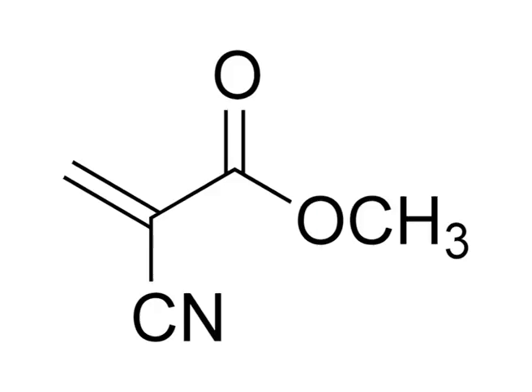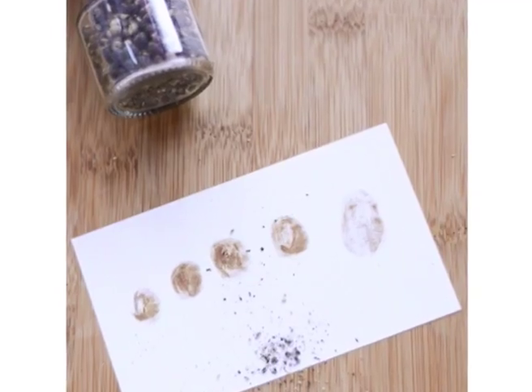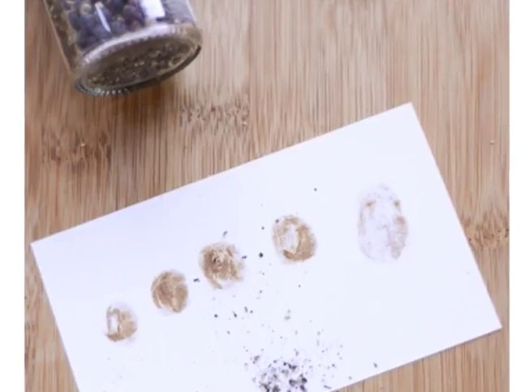A number of chemical fingerprint development methods such as ninhydrin, cyanoacrylate and silver nitrate require instrumental detection techniques such as laser and neutron activation analysis and therefore cannot be used for on-the-scene investigations. The object bearing the latent finger marks has to be carried to the fingerprint laboratory if any of these methods is desired to be used. However, iodine in conjunction with 7,8-benzoflavone may be used for detection of fingerprints at the scene of crime.